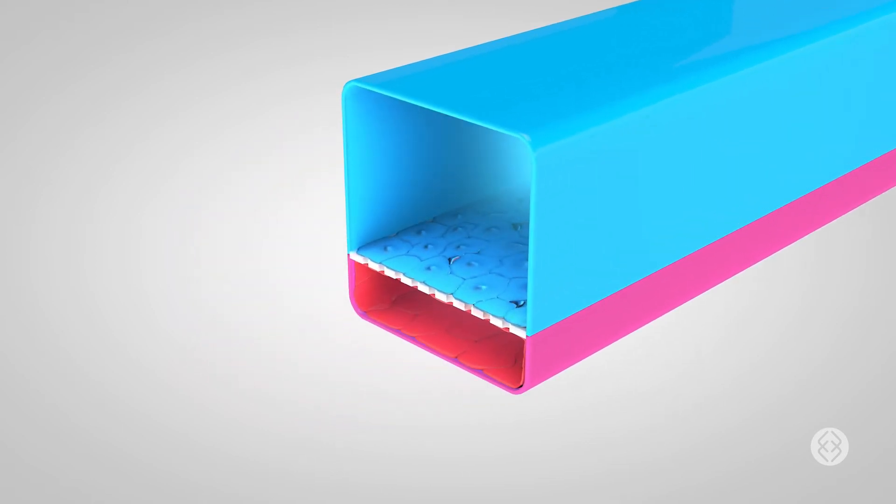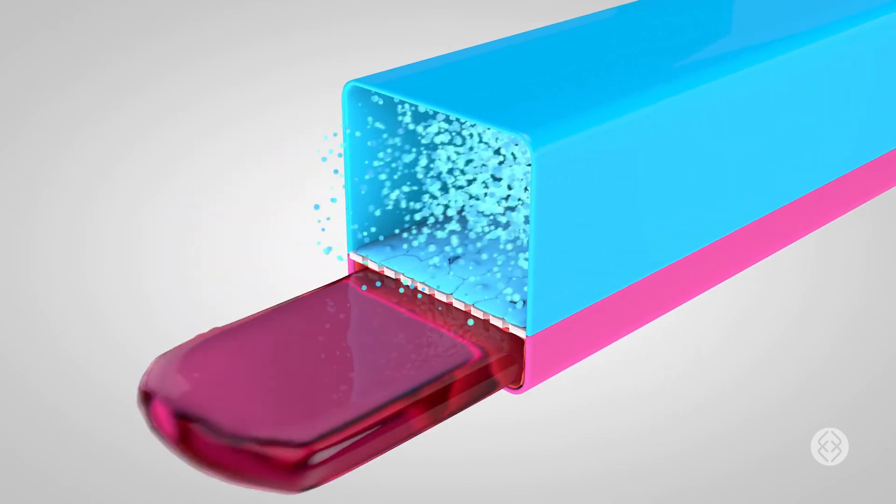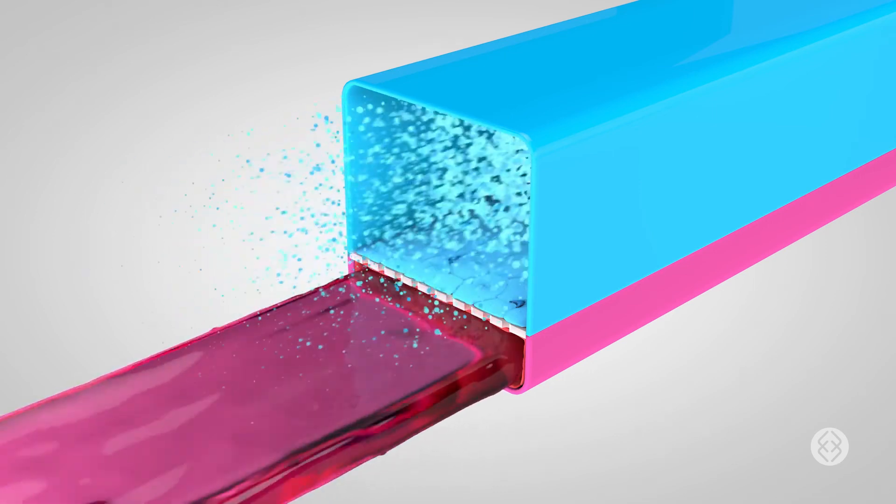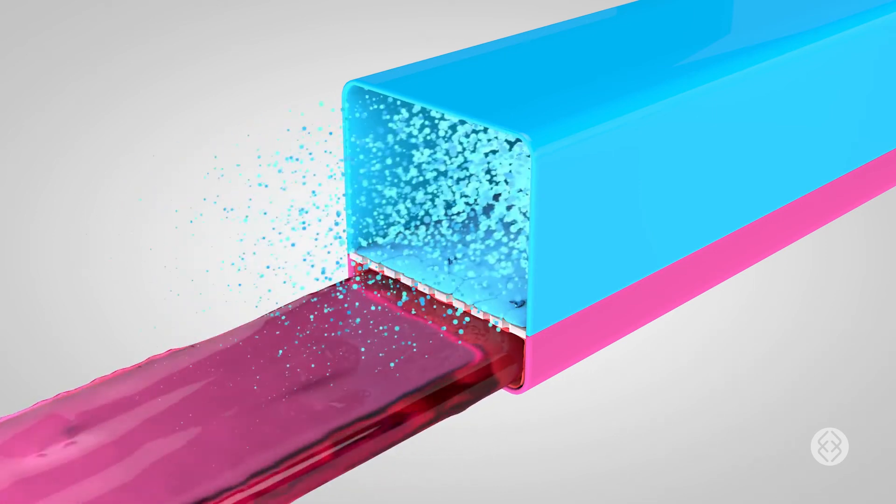The top channel is exposed to air while media that emulates blood flows through the bottom channel and applies shear stress to the cells.